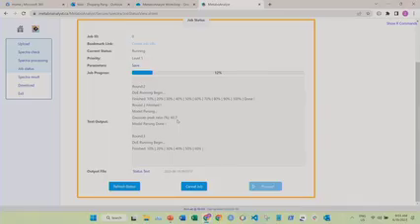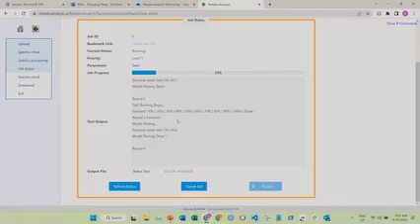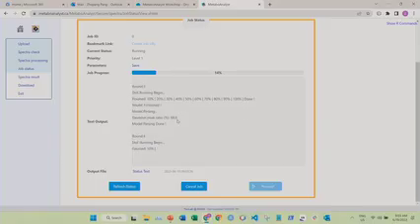Sure. So in the data you are uploading, it already has the names for each group, for example, control, sample, etc. In each stage, do you enter that information? When you upload the data, you need to provide a metadata file. It's a text file, including the information.